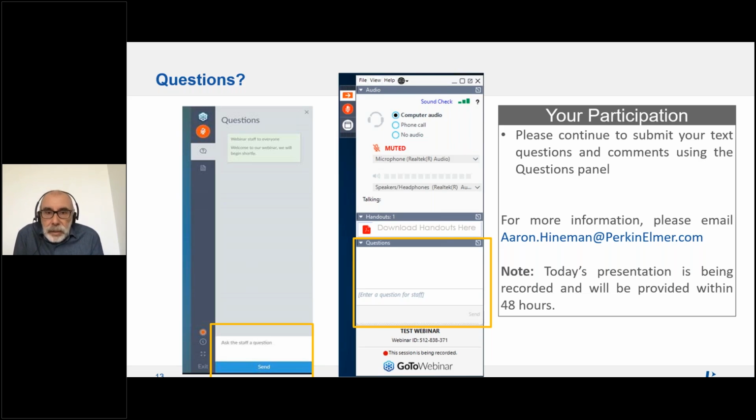Of course, I think the easiest way is some acidification of the sample and some purging, and we are removing the carbonate as CO2. And well, in this case, it works correctly. But in other cases, we have to try to remove this carbon background.